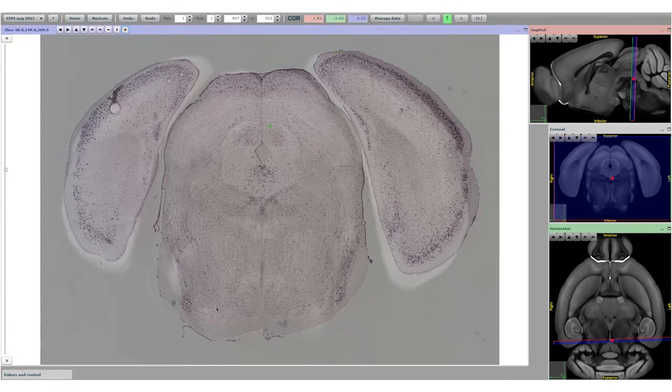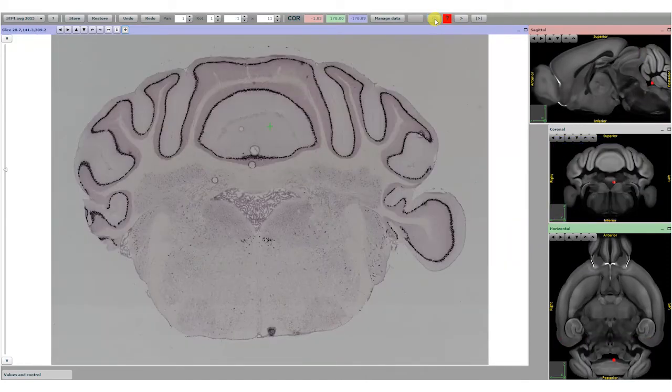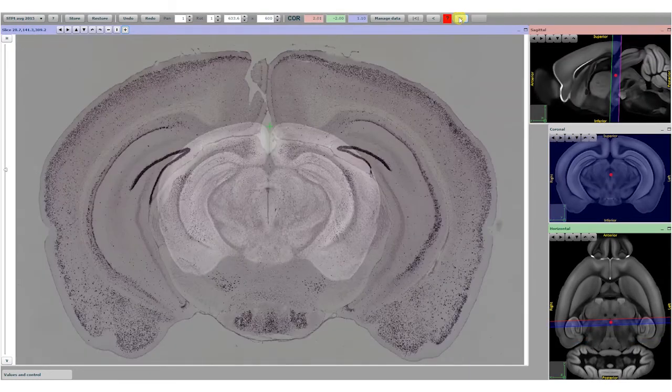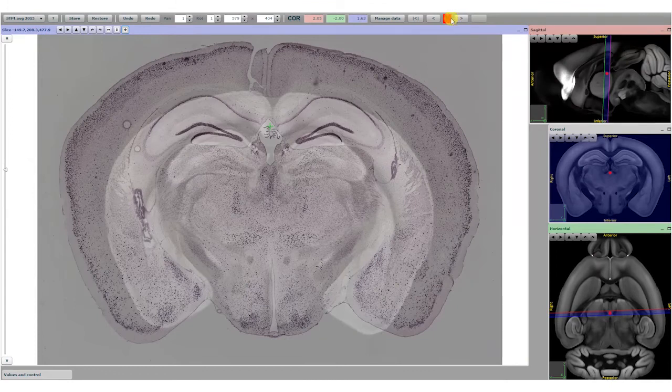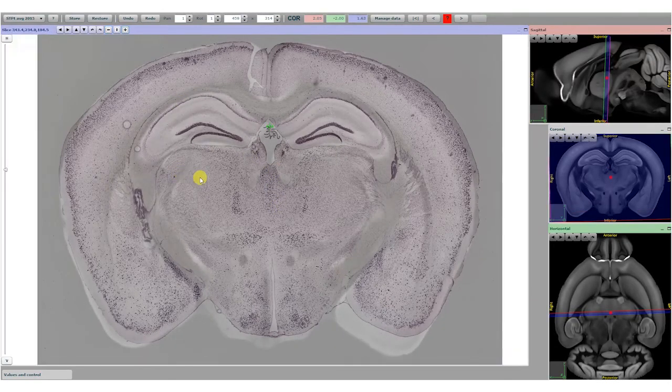If you go to the next section, you will see now, because I have two sections that are anchored, that even the ones that are not anchored are roughly what they should be. This one needs to be resized. Like this.